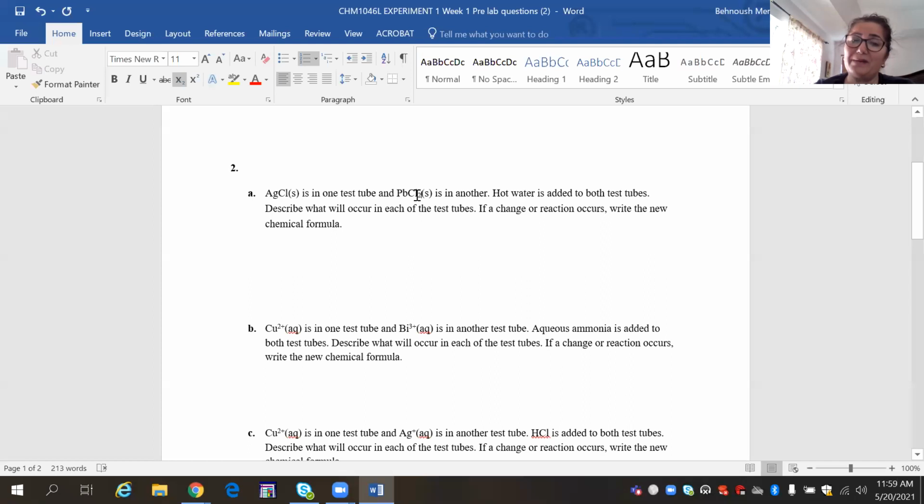When you read the experiment, or when you look at the flow chart, you see that PbCl2 will dissolve. And that's what it is asking you. All you have to say is, PbCl2 will dissolve. So this one requires a sentence. The top one required only a number and formula. So it depends on the question. I'm not asking for a paragraph for each question, if that's your concern.